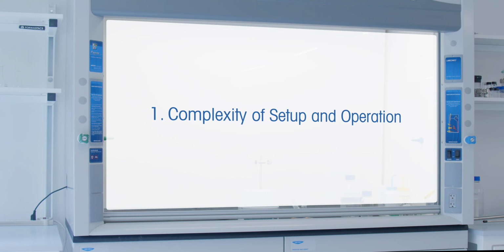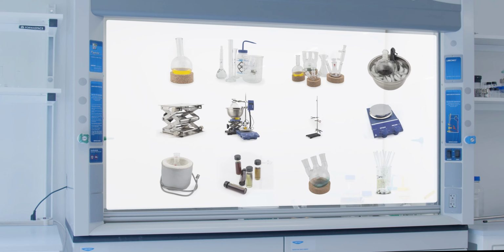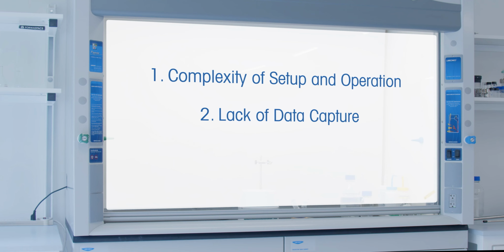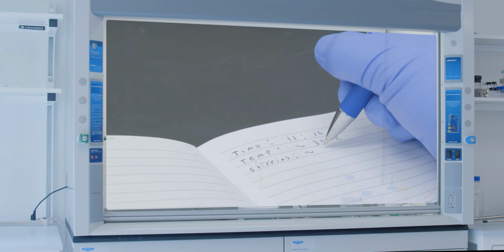The complexity of setup and operation. Consider all of the equipment typically needed. It takes a lot of time and experience to set up a manual synthesis apparatus. The lack of data capture. Many times researchers don't record critical details that make the experiment difficult or impossible to replicate.